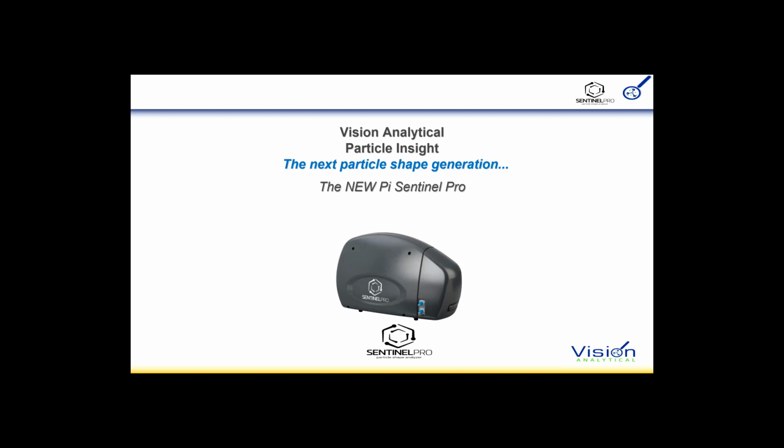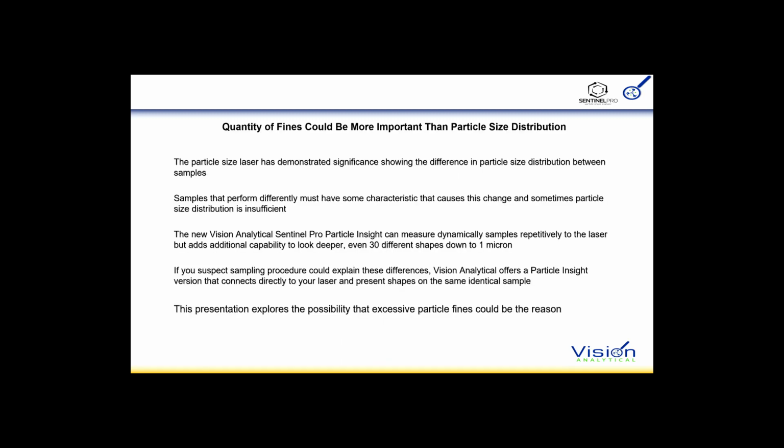Now the units: it's available as a standalone version that runs by itself, or a shape module that you connect to a laser instrument. And we currently have kits to fit the Malvern Mastersizer 2000 and 3000.